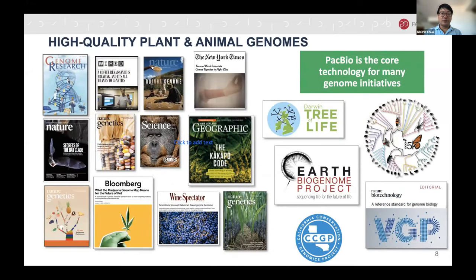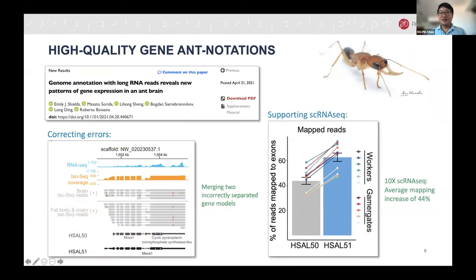We have seen more and more publications coming out in the literature in recent years where PacBio is the core technology for many genome initiatives. Shown here is a very nice example of a recently published paper looking at gene annotation with long RNA reads, which is essentially PacBio IsoSeq.